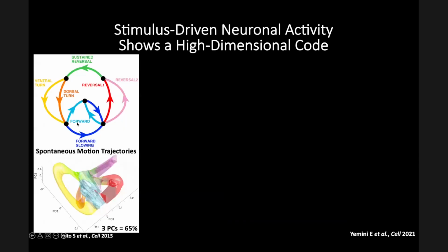Now, this is some earlier work from a paper I was on in 2015. Here, this is just one worm in a microfluidic device, and we're observing what the neurons are doing. It's immobilized, but we can tell you what the fictive behaviors are based off of which neurons are active, right? So we can see it thinking, if I can anthropomorphize the worm, that it's going forward, reversing, turning one way or another.